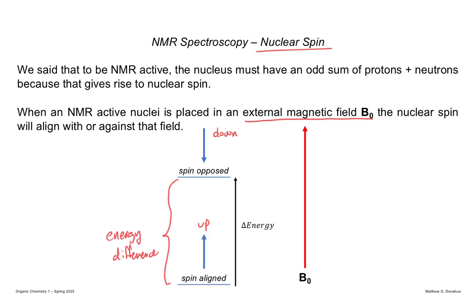And then as they relax, that's the signal that's acquired. A bunch of math happens, and it spits out the thing we read as a spectra. But the take-home point of this is you have two spin states, and that is what leads to the n+1, and that is what leads to the intensity difference of the signals we see.